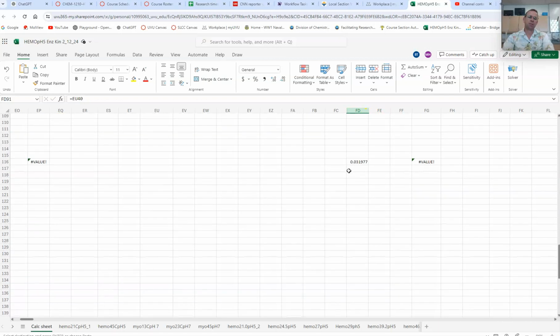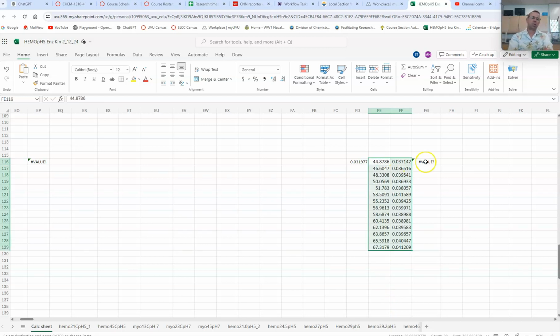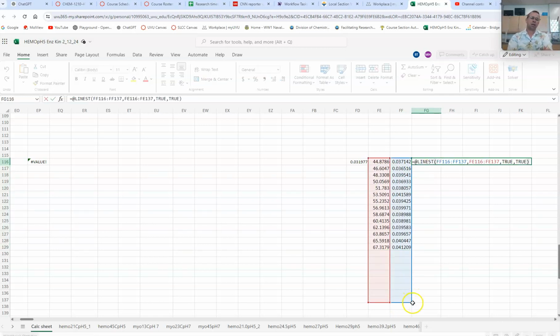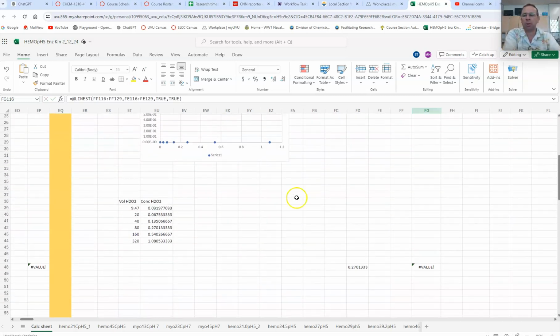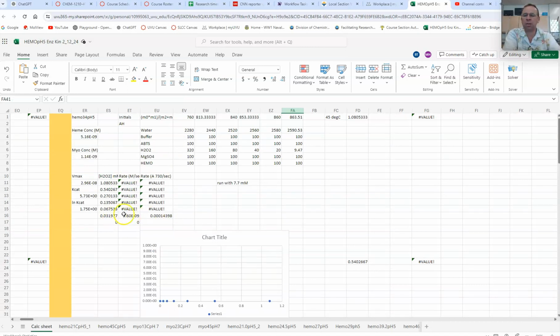So I paste that slope, for those data points that represent that slope well, right here. I double click on this, and then I adjust the boxes by grabbing the corners so that it highlights just my data points and nothing extra, and now it generates the slope of that line for me. That number is also copied over in this space here for the rate, the slope at which the hydrogen peroxide is disappearing. It's converted to a molar slope as well, and it's plotted versus the concentration of the hydrogen peroxide that was used. So I've got 1 point down there.